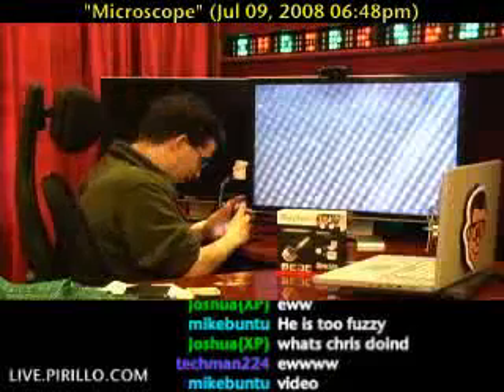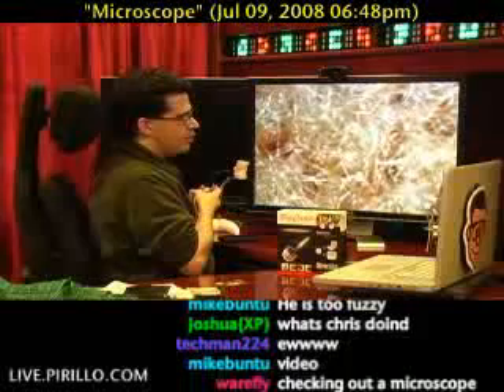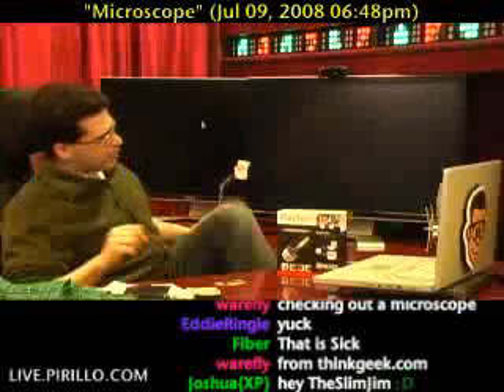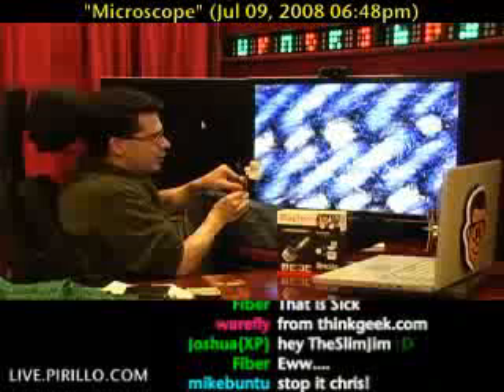Let's take a look at my fleece. Nice and fibrous — it's almost as soft as my dog. Let's try my blue jeans. And I'm guessing they're going to be... blue. Yep, I knew it. I'm telling you, it's really good resolution. What about my sock? Very fibrous once again. What is that? You know what would freak me out if I was doing something like this and something ran across it?